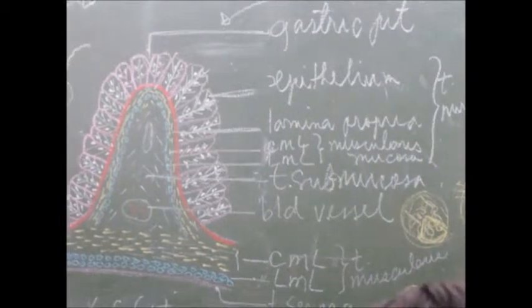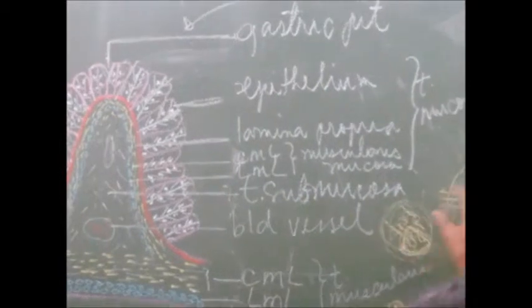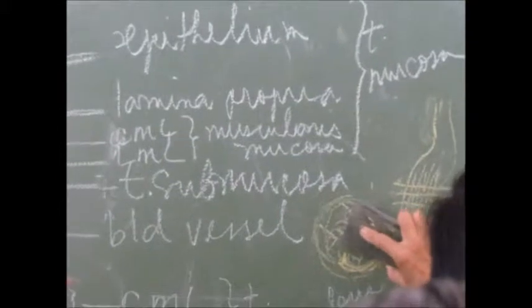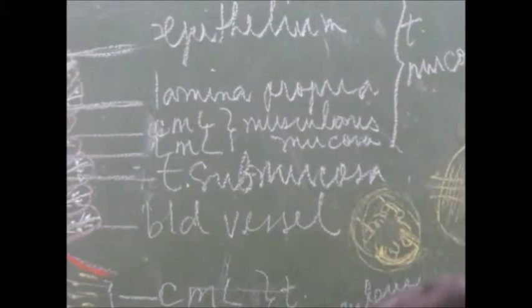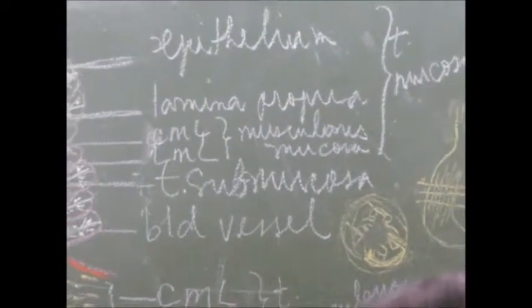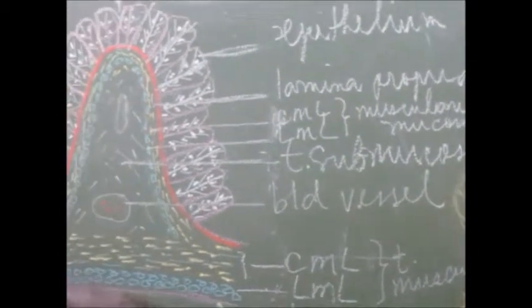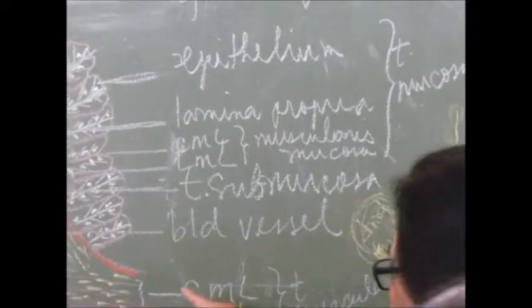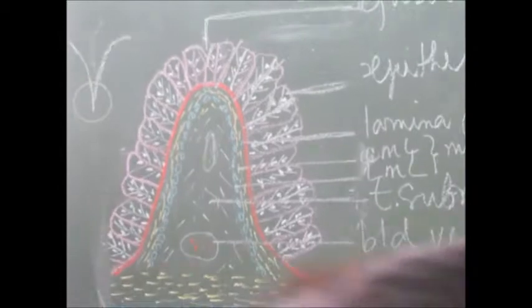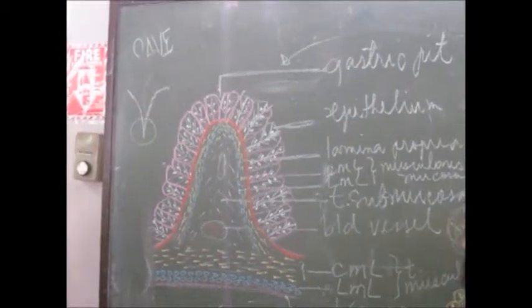Cross-section of the stomach. What you can find in one piece is exactly the same, except that you can find the cavity or the space for the food to pass through. That is why we represent one system. You understand? So this is one sector of the entire cross section.